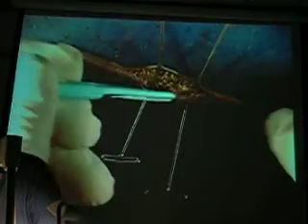Well, it stands. Alright, so now what? Here's what happens. I'm going to go ahead and try to make this incision with this very sharp scalpel. I'm going to bring one of the equipment today.